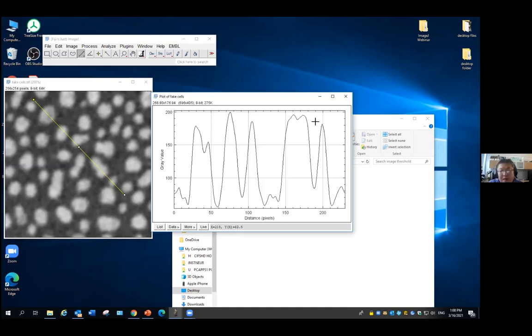So those parts are the cells, and those are probably the background. I think maybe I can use this intensity as a parameter to tell us which pixels are the cell and which pixels are the background. The difficulty for the program to draw the outline is that it doesn't know what is the cell and what is the background. So we need to give the computer a very simple parameter to say: when you count on one pixel, what makes this pixel part of my cell, my signal, my object? What pixel belongs to the background, which I don't care about?